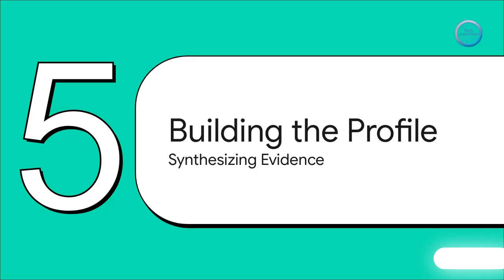This brings us to our final section, building the full profile. We've talked about this whole toolkit, with each tool giving us a specific piece of the puzzle. Is there ever a single best method to use? That's the most practical question you could ask, and the answer is a very firm no. There is no single magic bullet technique. Each method we've talked about gives you a different, complementary piece of the story. Each one has its own strengths and its own blind spots.